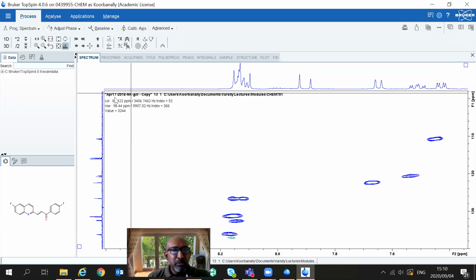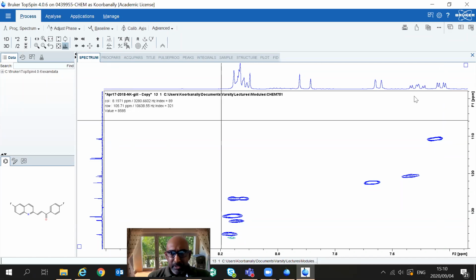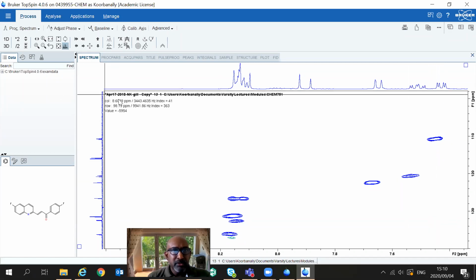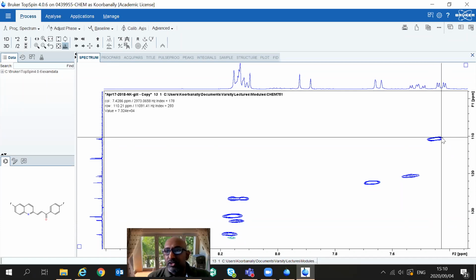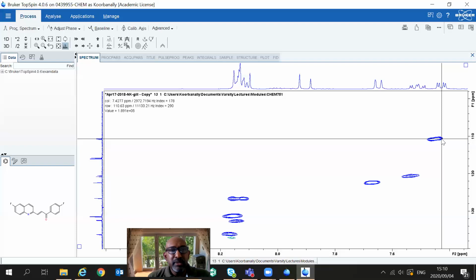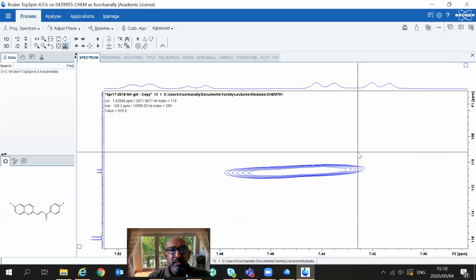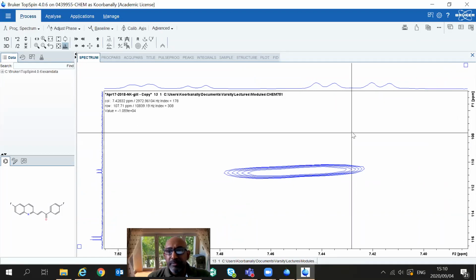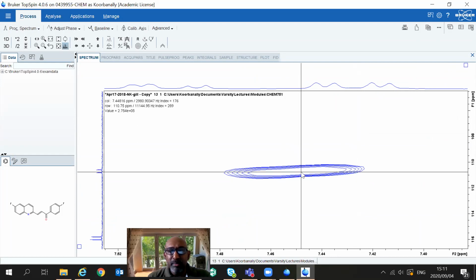And this resonance, I'm looking here, because this is the column that it is in. So downways is a column. If I'm looking at this particular resonance, I'll look at this value here, and the calibration should actually be here. I can also expand this particular resonance so I can see it very clearly. Can you see that I should have the center appearing here, not to my left? So it's actually a messed up spectrum.